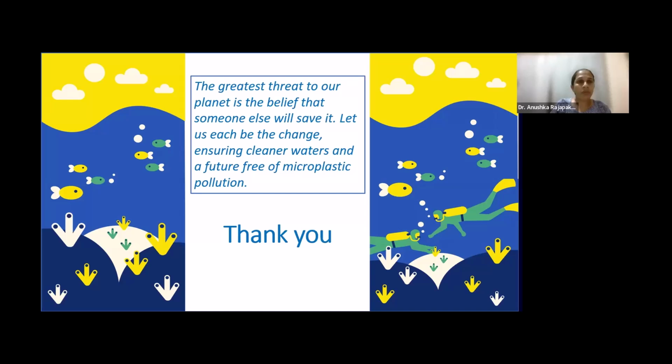Can you suggest more promising methods to detect microplastics in edible fishes? Edible fish, I'm not sure whether the spectroscopy or pyrolysis method will work, but in thermoanalytical pyrolysis GC, as we detect the mass fraction, we can homogenize a large number of samples and take a representative portion.